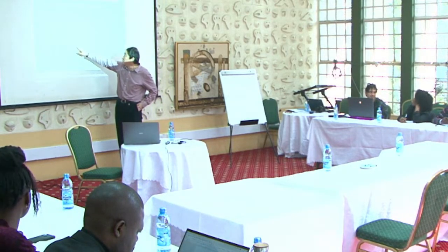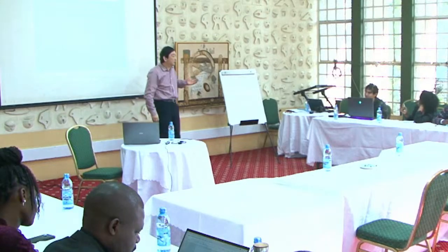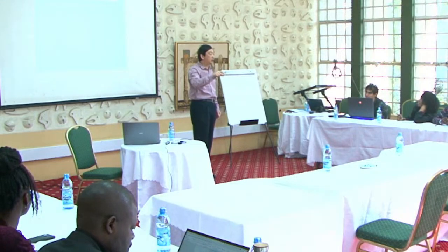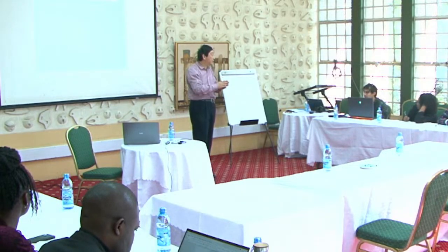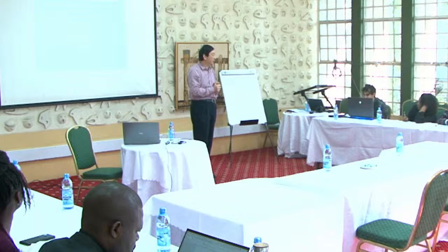And if you see this difference, 84 to 69, the difference is 15. So 15 is a methyl group. So that's very reasonable, right? So most times when you see the molecular ion, you want to see the neutral loss. If the loss is within a reasonable range, generally that's the molecular ion.